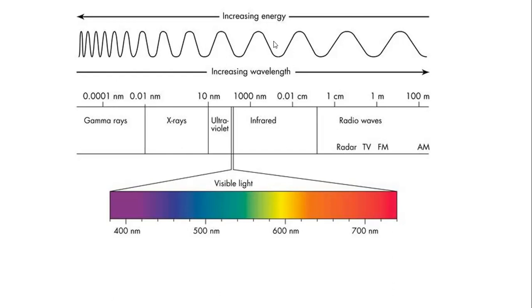Because there is deviation of the light radiation, your detector, which is going to detect the amount of transmitted light after this event, may lose out on this radiation and may record it as absorption.